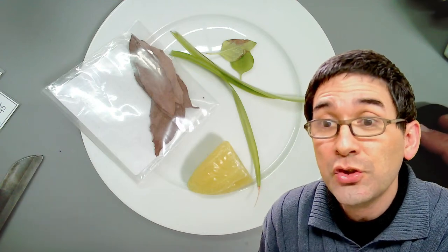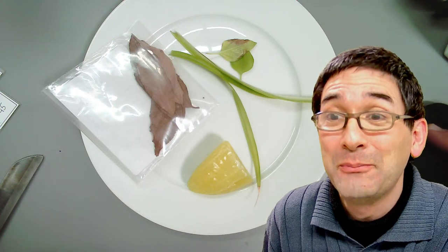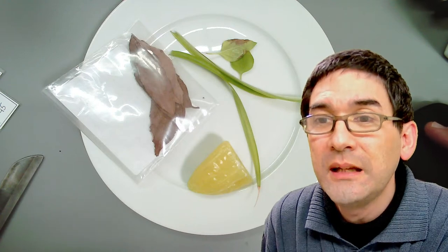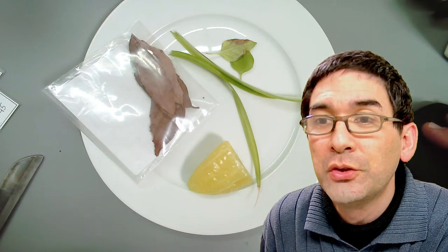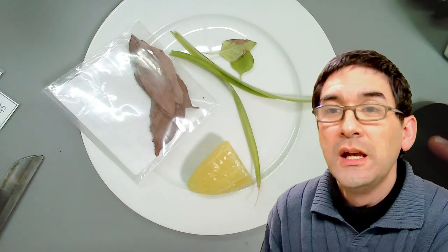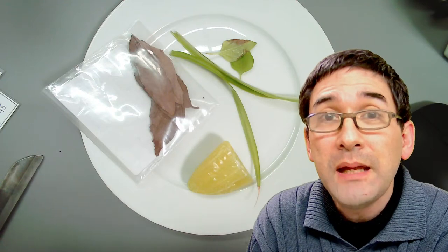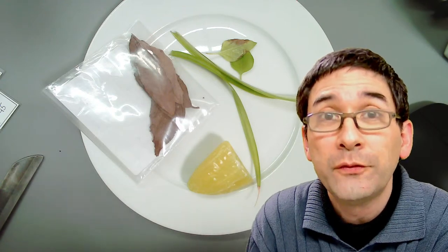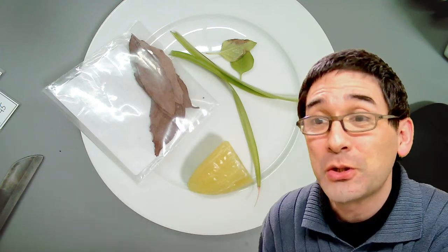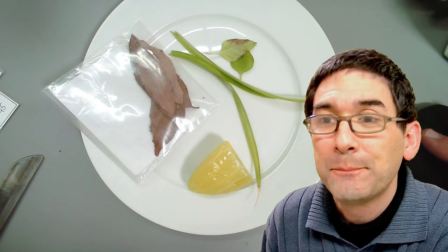Asian supermarkets have prepared natto — yes, unfortunately I'm in Europe here so I'm not able to buy it. Maybe there are some Asian shops. Someone recently bought a microscope and is wondering where to find good samples from parks. Do you recommend Rheinberg filters? Well, if you want to make filters yourself like Rheinberg and dark field filters, I highly recommend them — they can be easily made yourself. Especially Rheinberg filters and dark field patch stops can be made yourself.